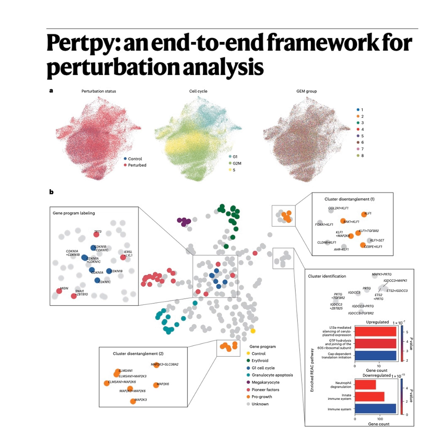Okay, so we've assigned our perturbations. Now we hit the next big wall. Confounding factors, batch effects. The enemy of all large studies. Right. If one plate was processed on Tuesday and another on Friday, that technical noise can just drown the real biology, especially for subtle effects. You're at risk of finding a false discovery, mistaking an artifact for a real interaction.